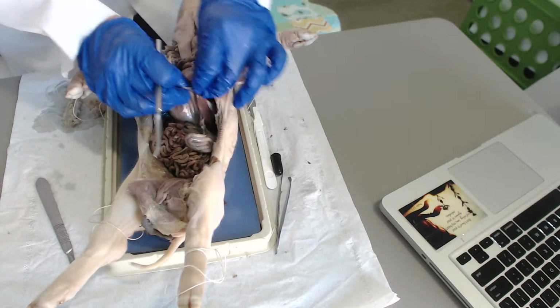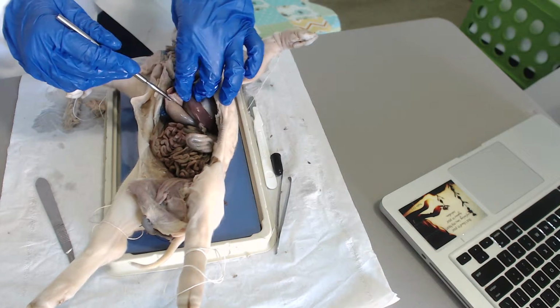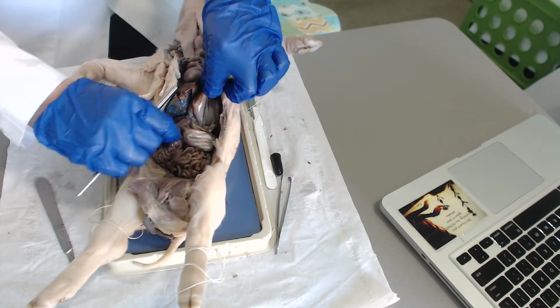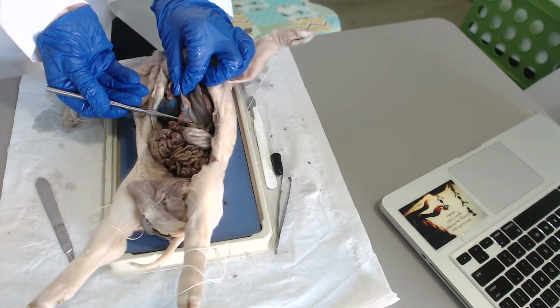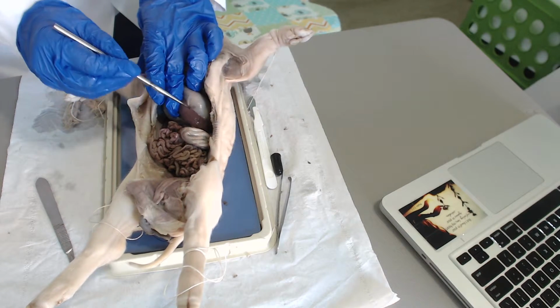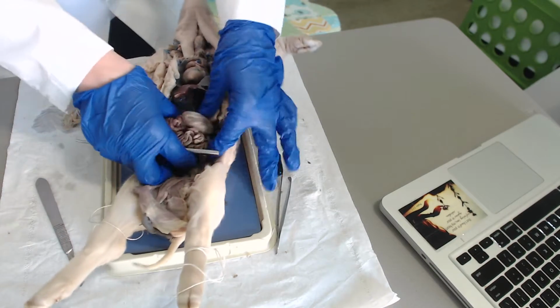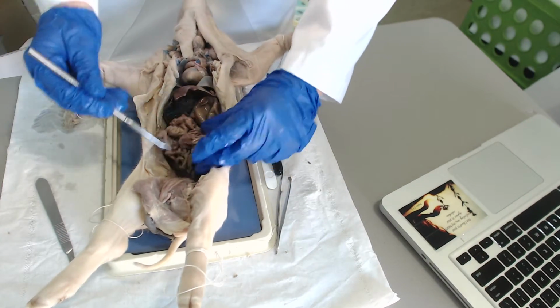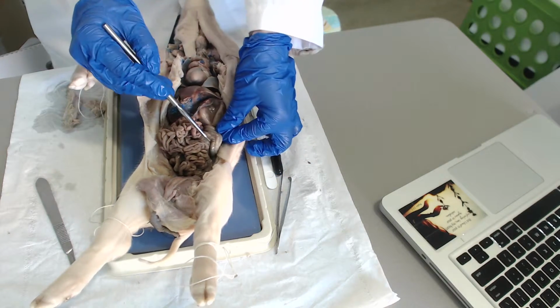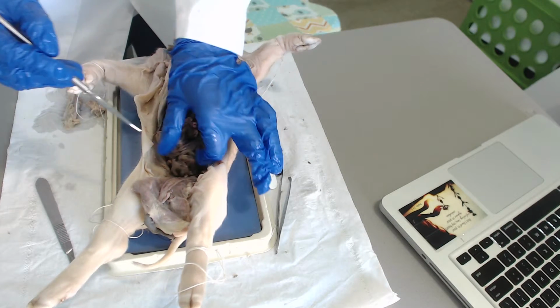A lot of our blood cells, so the spleen. Okay, I'm sorry, we passed the small intestine. So duodenum, the pancreas, and the spleen. So there, after that, you're going to look at the stomach contents. So the small intestine is right here. The large intestine has more ridges, so that's the large intestine.